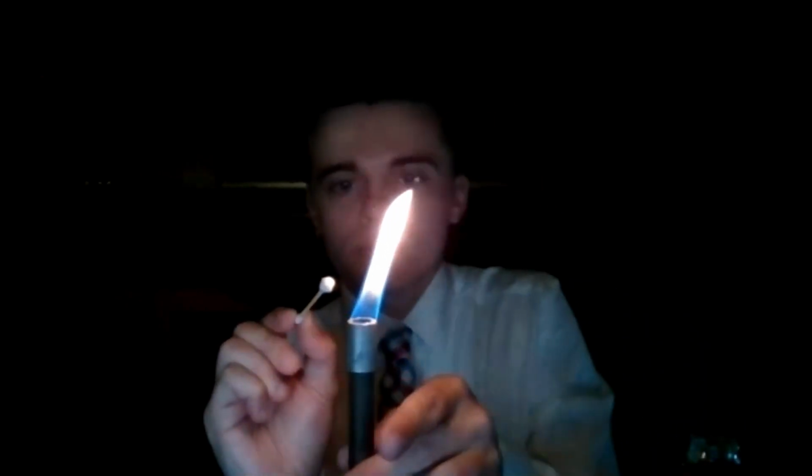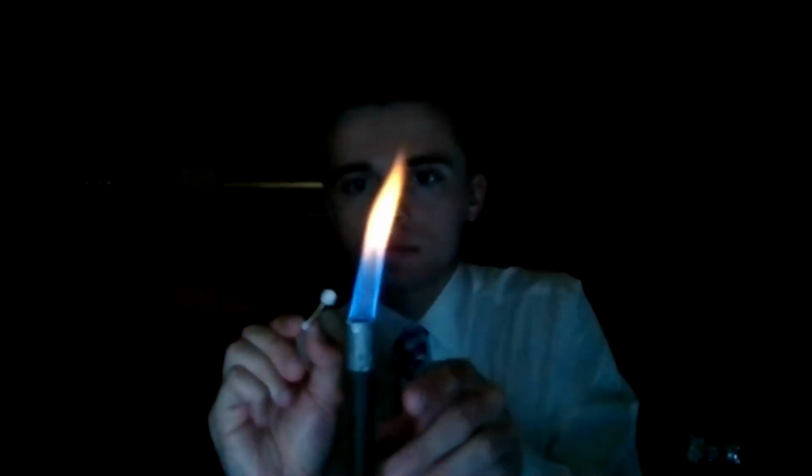Yeah, this one's hard to see. Maybe if I do it this way, I might be able to see it a little better. No. It has a nice yellow color to it. Okay. Is there any one that you wanted to see again real quick before we do the unknowns?